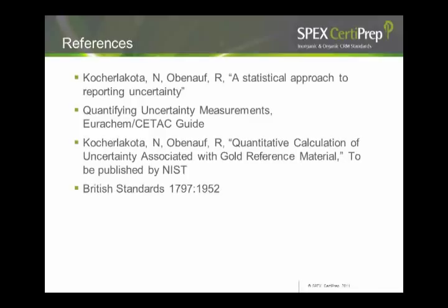Now, similar to what we did for SRM, we did for CRM. We took 9 samples, made analysis on that by ICP. Now, the average is given here, X bar, 100.797. The standard deviation is 0.3065. Now, this again is a type A uncertainty. So the value of uncertainty calculates out to be 0.102165. And this is the standard deviation divided by the square root of the number of replicates, and we arrive at this 0.102165. So you calculate the relative standard uncertainty by dividing the uncertainty by the value here.